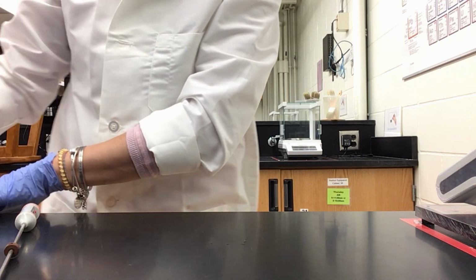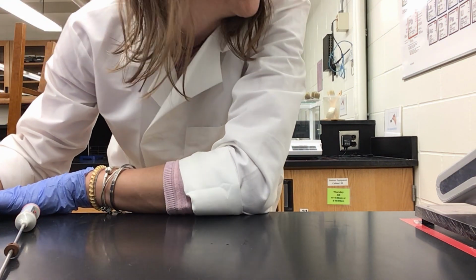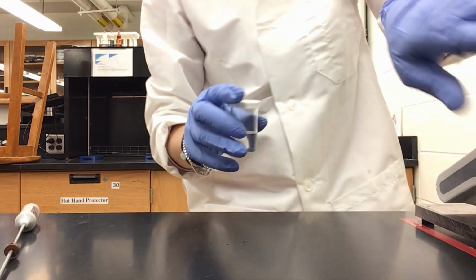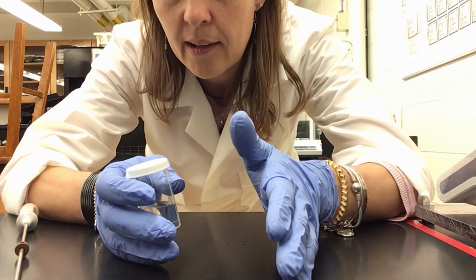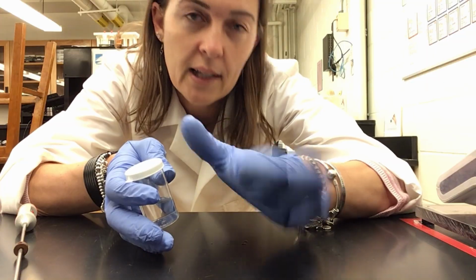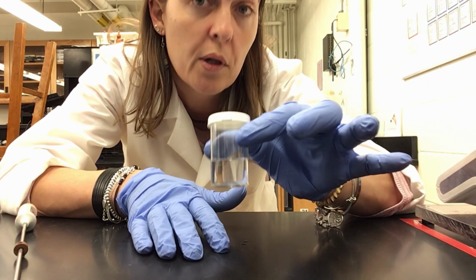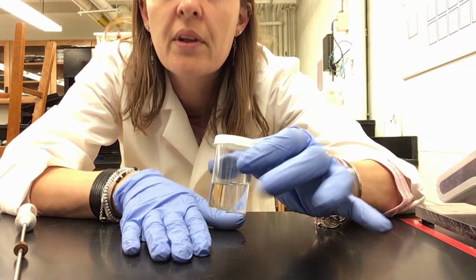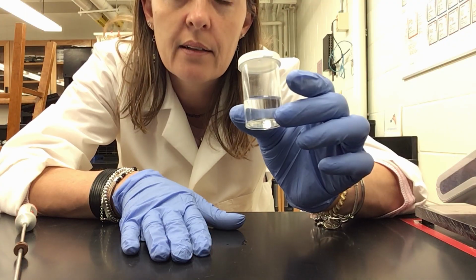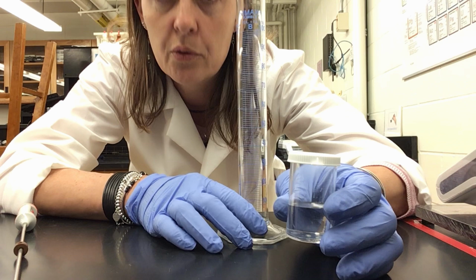This time the weight is 16.614, which means that my eye hasn't been as good as it was with trial number 1 and trial number 2, because evidently the meniscus was slightly lower than before, but that's okay. So now I'm gonna dispose of this, and I'm gonna repeat the measurement using the 100 ml graduated cylinder.